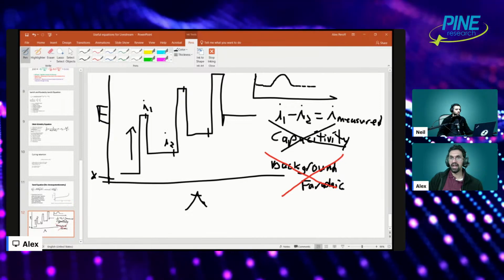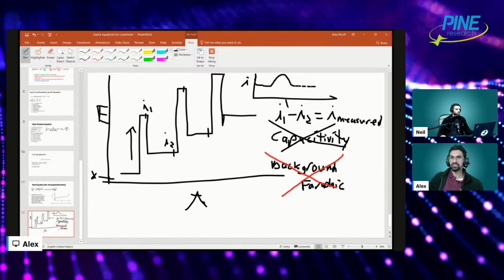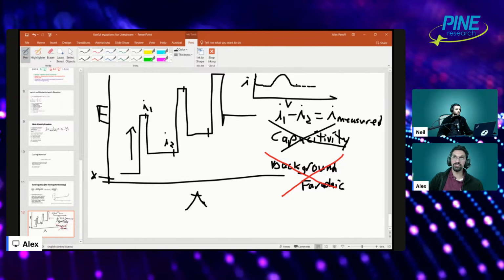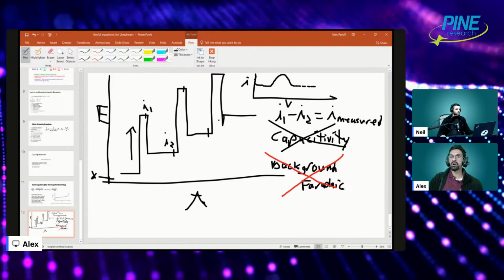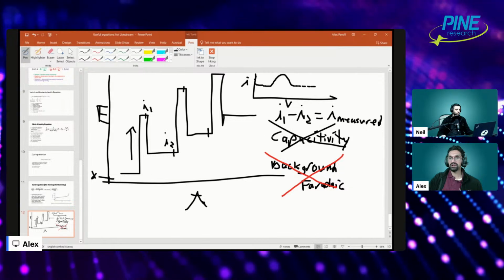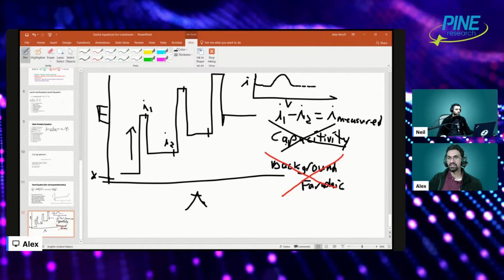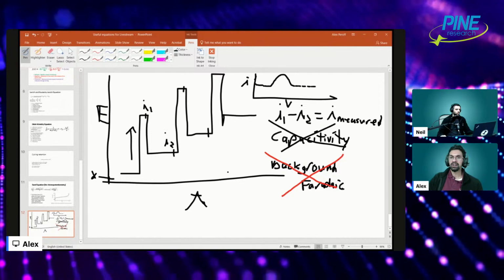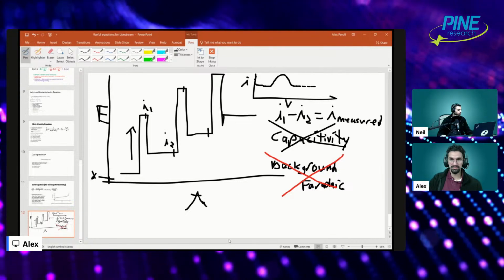So it's a very highly sensitive technique, and again, it's current versus voltage. That's the advantage. It's actually used in a lot of analytical techniques where you have a very low concentration of a species, and you need to remove these background signals that commonly convolute your signal. So that's a brief description of differential pulse voltammetry in a nutshell.